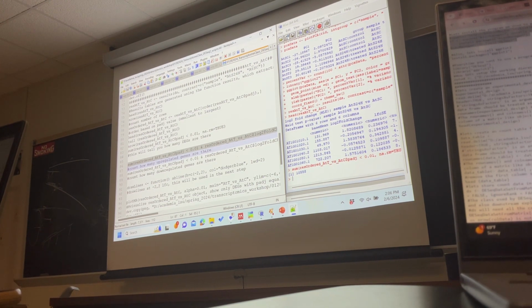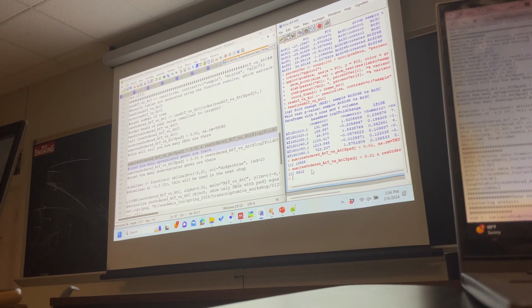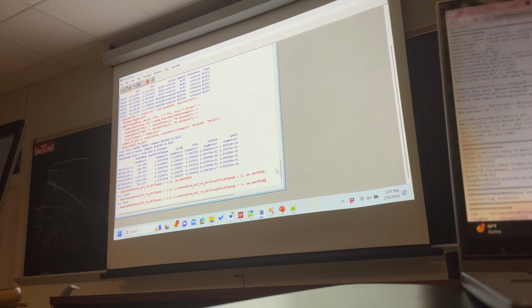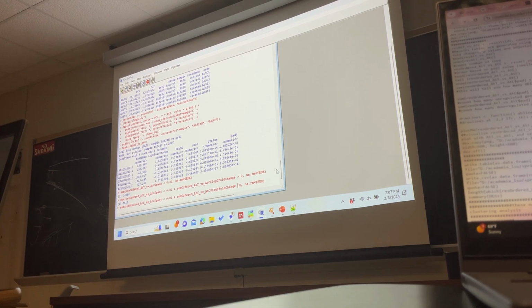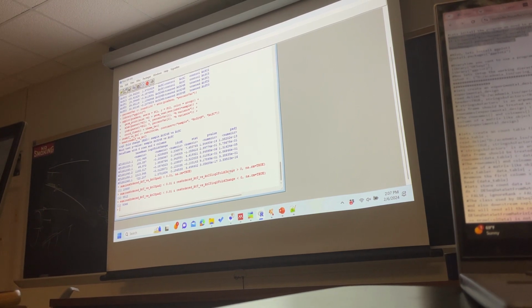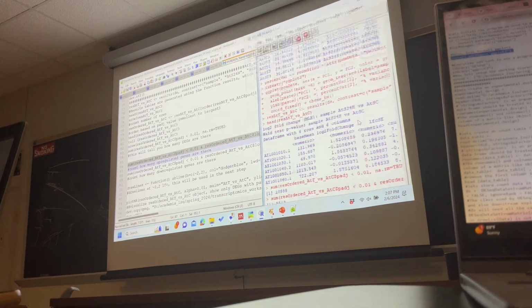But basically here I am trying to see how many genes are upregulated. If you want to get the downregulated ones, you just have to change this to less than 0, like negative values in a fold change. So you will get the downregulated genes there.